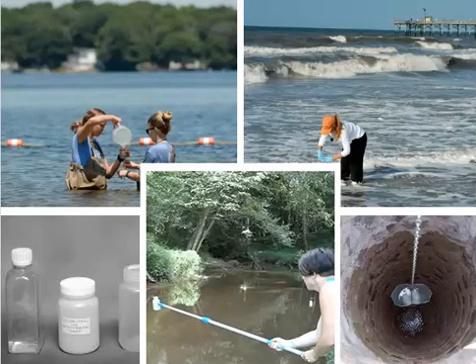There are several pictures on this slide that show different types of containers that people use and different types of apparatus to take samples from different environments. Let's take a look at each one separately.